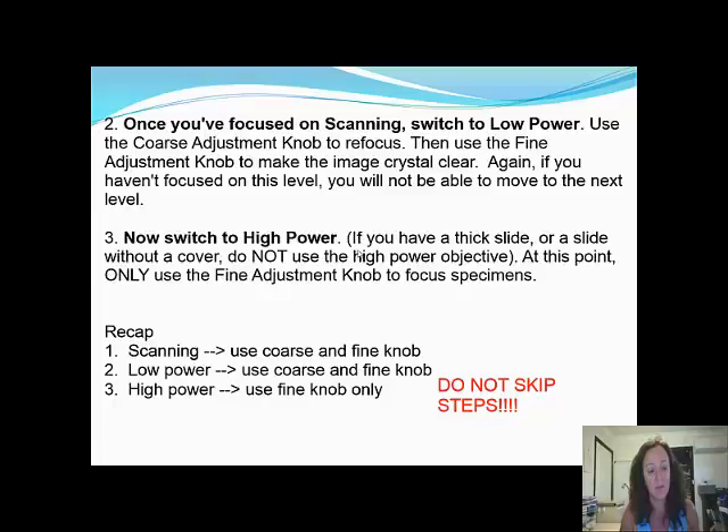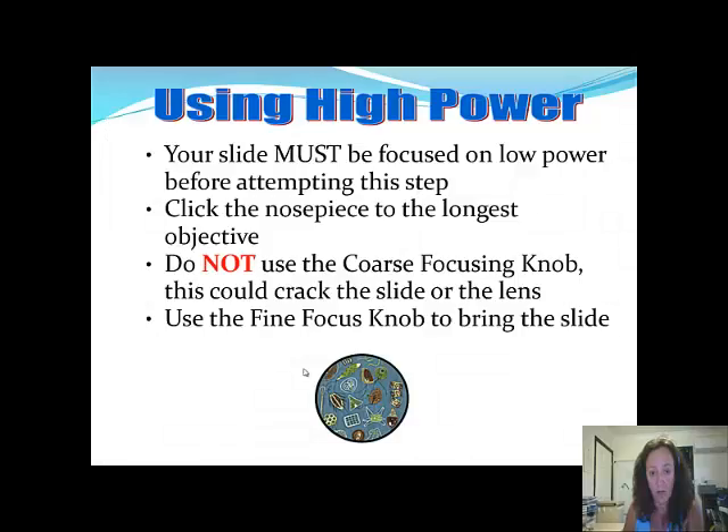Once you've found what you want to zoom in on, switch to high power. It's really important to make sure there's enough room for the objective lens to move without cracking the slide. Recap: scan using the coarse and fine knob, then move to low power using coarse and fine knob. On high power, only use fine knob adjustments — if you use the coarse knob, that's when people crank it up and smash into the slide. Your slide must be focused on low power before clicking the nosepiece to the longest objective. Do not use the coarse focusing knob on high power, as this will crack the slide or the lens.